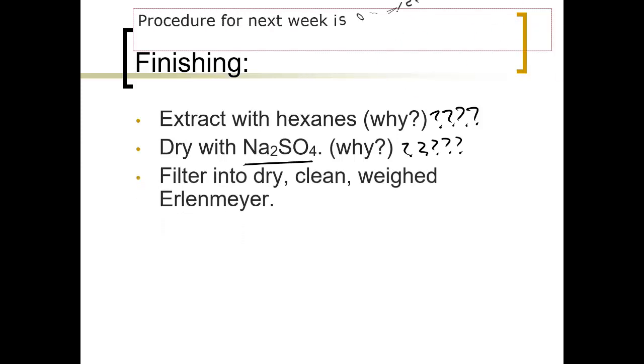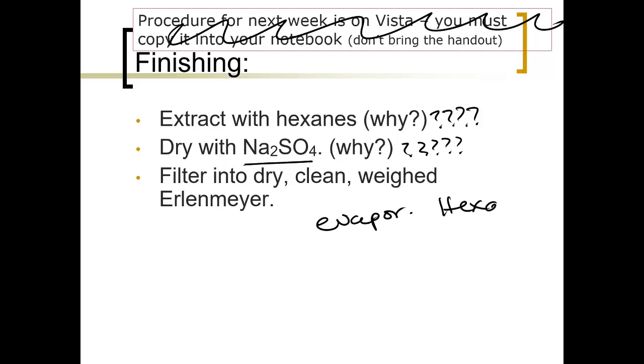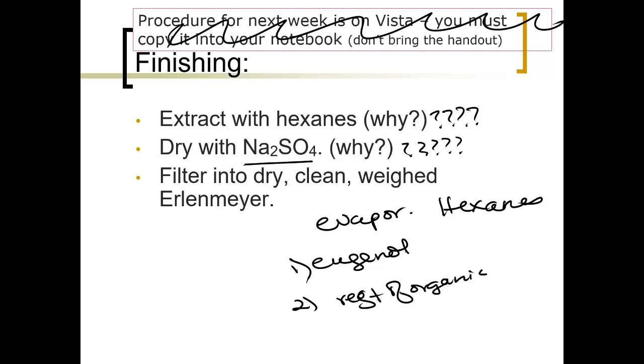You're going to filter out the anhydrous sodium sulfate. You're going to get the liquid. This doesn't pertain to our class, but you're going to evaporate off the hexanes in a water bath. And you're just going to get eugenol in one container, and two, then the rest of the organics. So you should have two samples that you're going to get IR for, GCMS, and you're going to get your weights.